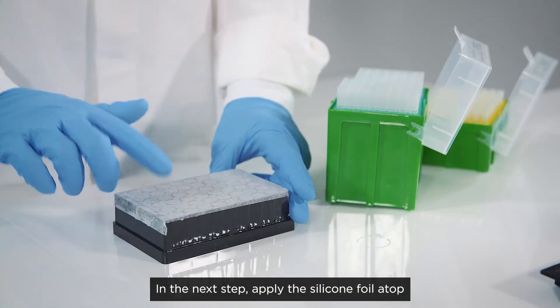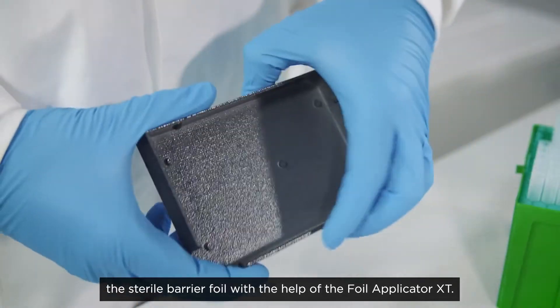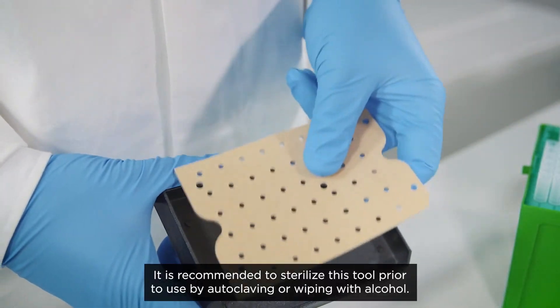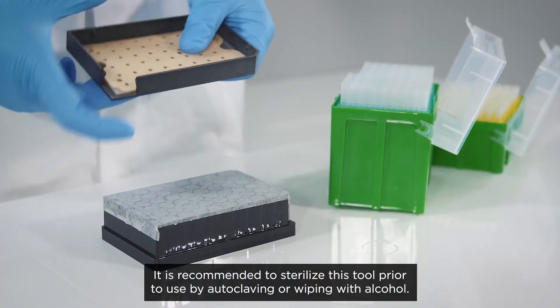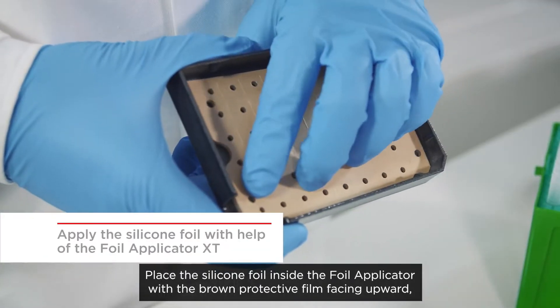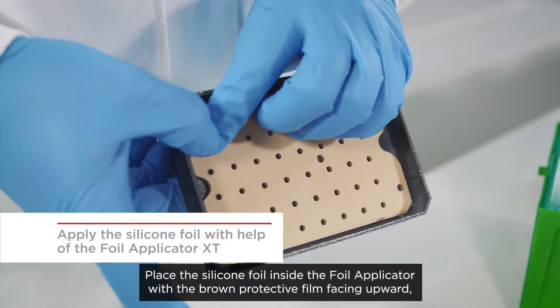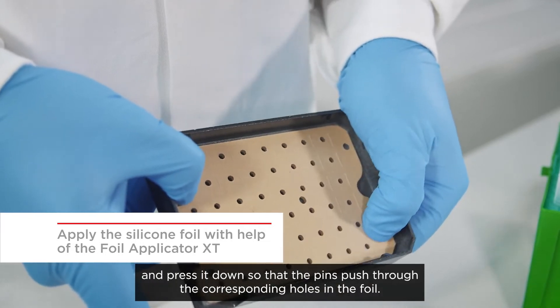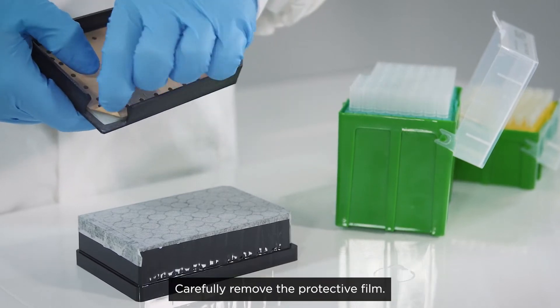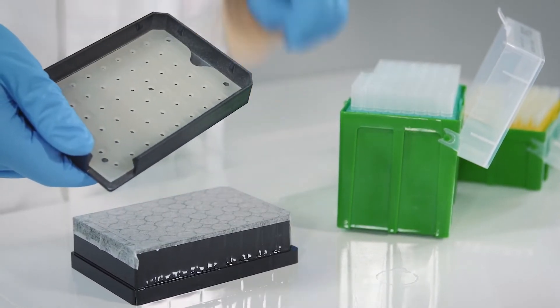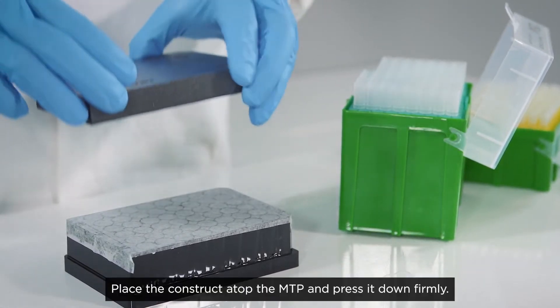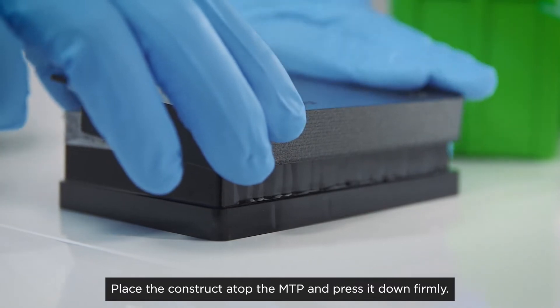In the next step, apply the silicone foil atop the sterile barrier foil with the help of the Foil Applicator XT. It is recommended to sterilize this tool prior to use by autoclaving or wiping with alcohol. Place the silicone foil inside the foil applicator with the brown protective film facing upward and press it down so that the pins push through the corresponding holes in the foil. Carefully remove the protective film. Place the construct atop the MTP and press it down firmly.